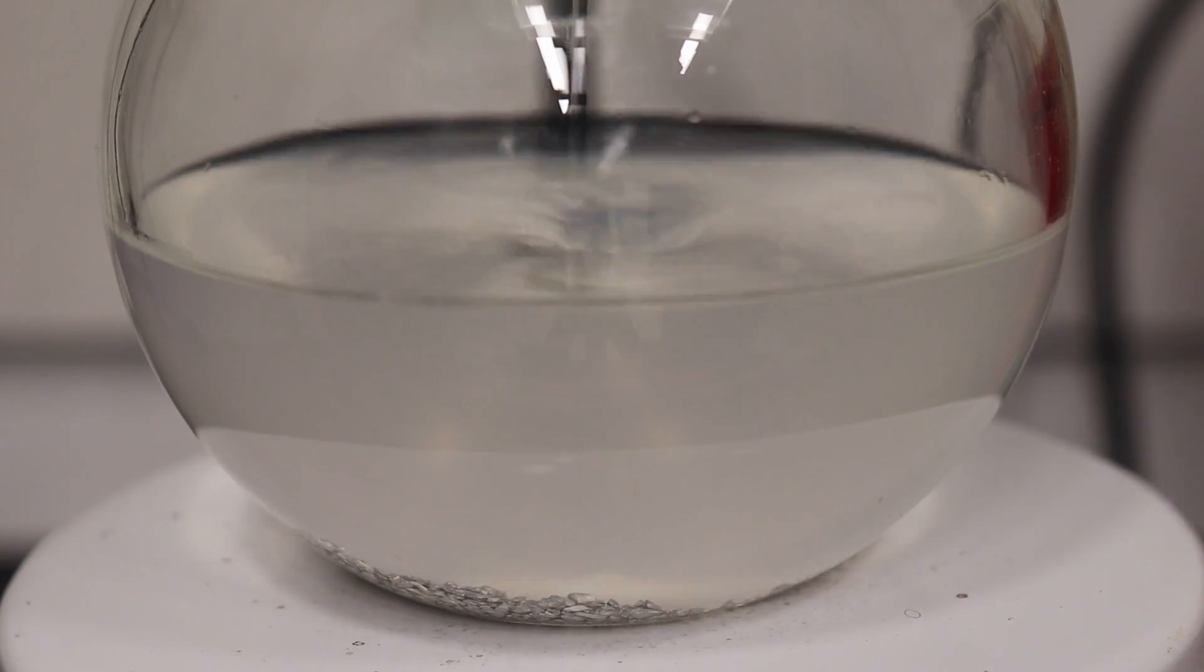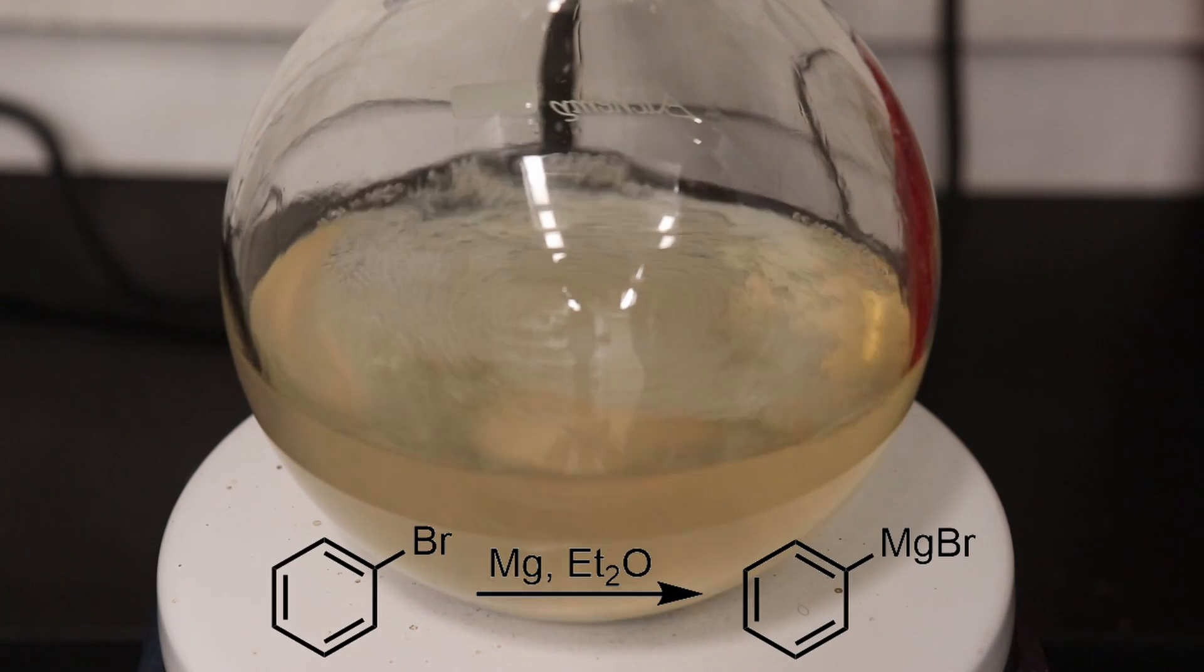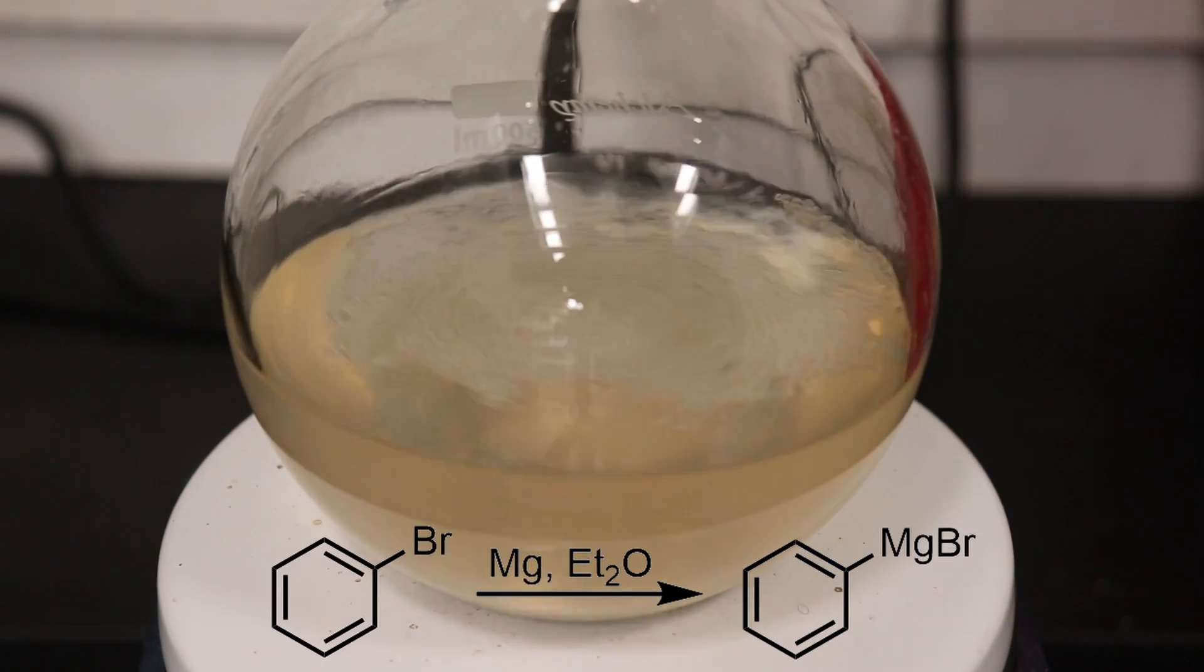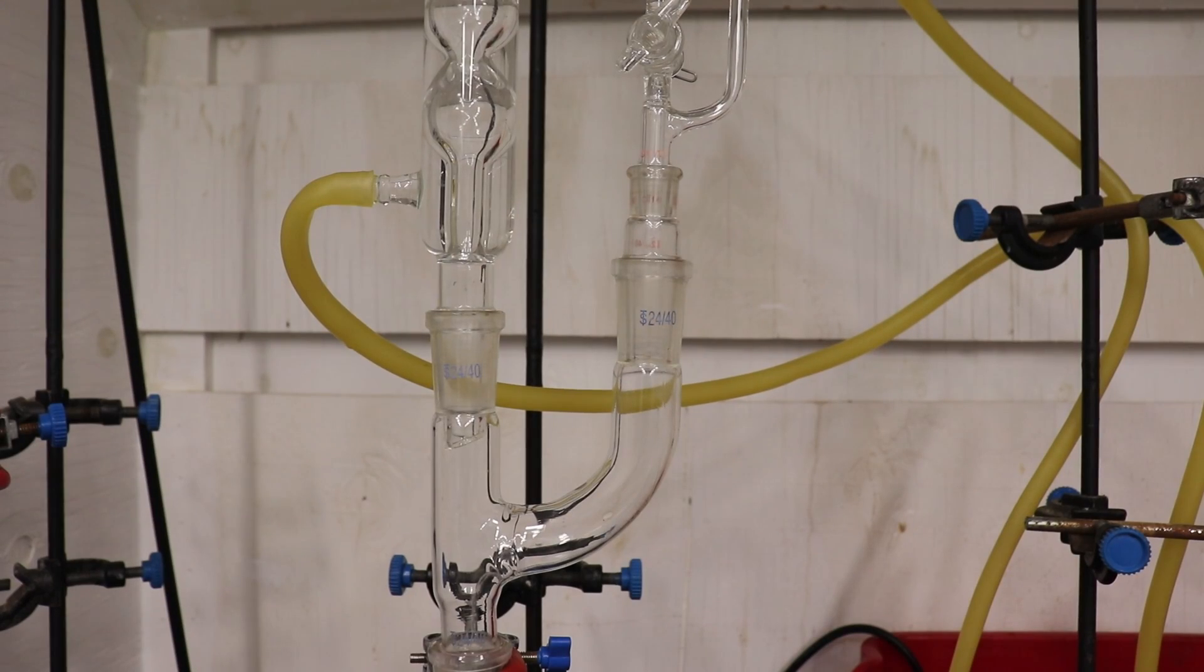Eventually the yellow coloration from the iodine faded and a cloudiness appeared which indicates the start of the reaction. Shortly after, a tan coloration appeared in the solution and it began to reflux spontaneously. After the initial exotherm had died down, the dropwise addition of bromobenzene was started at such a rate as to maintain the reaction at a good reflux.